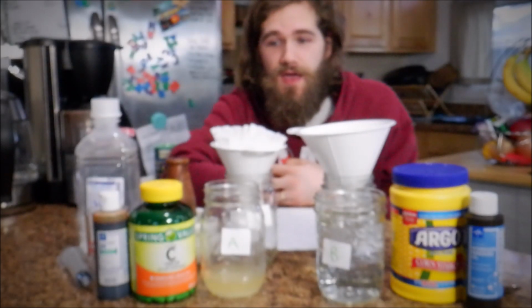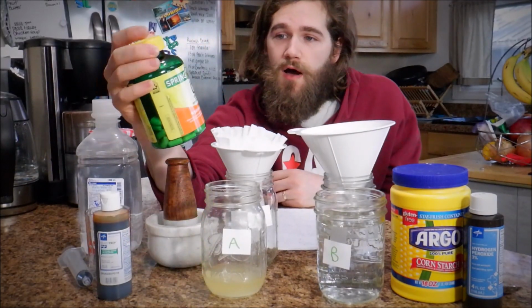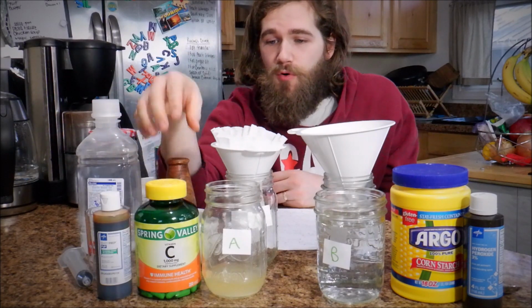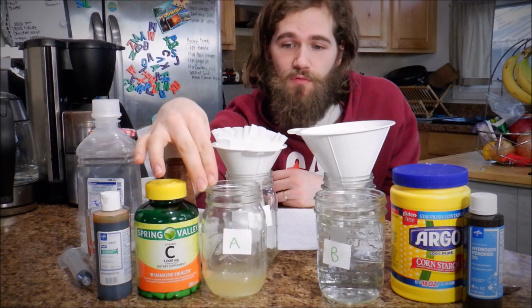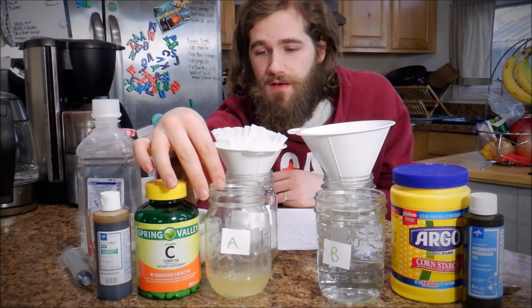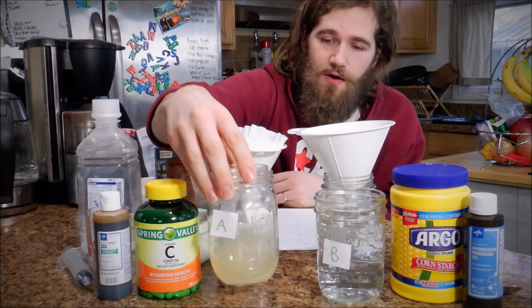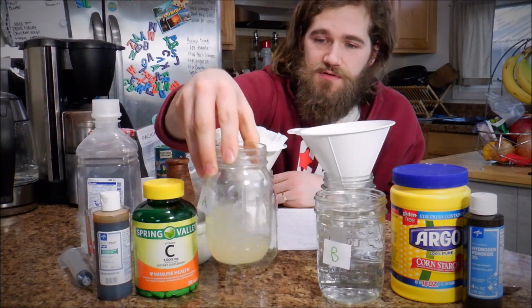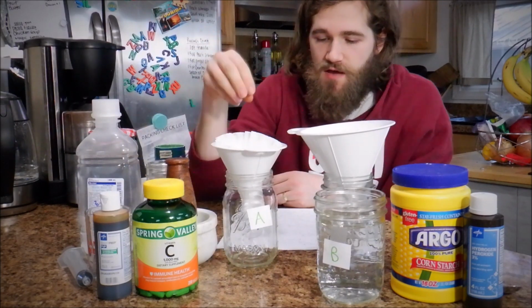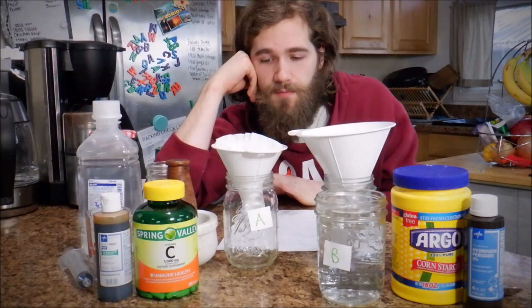So in solution A, I have already mixed up two tablets of the 1000 milligram vitamin C in my mortar and pestle. They are right here. I put about 60 mLs of water in there, and it's a little cloudy, so we're going to actually filter that out right now using just a coffee filter. And once that gets filtered out, we're going to be adding some povidone iodine to that here in a minute.